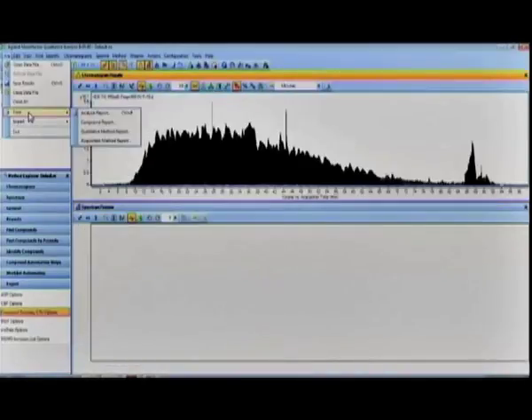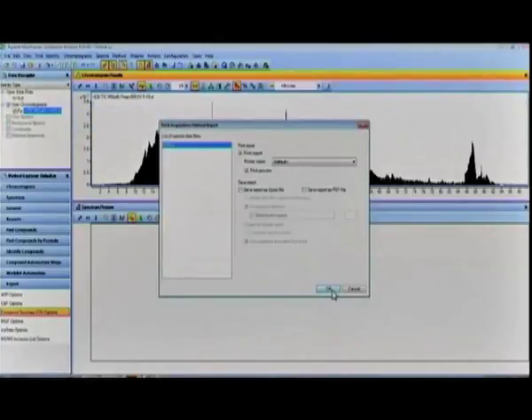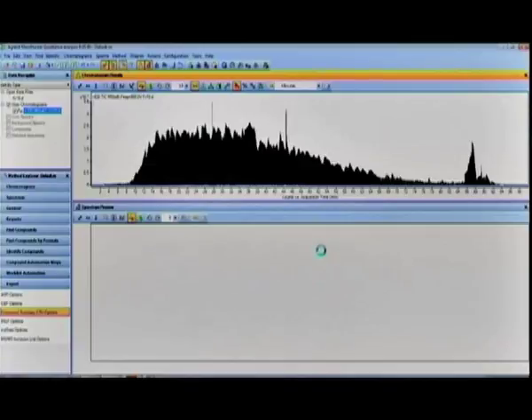By clicking on the print option followed by acquisition method report, we can get the LC-MS/MS method which was used for the data acquisition.